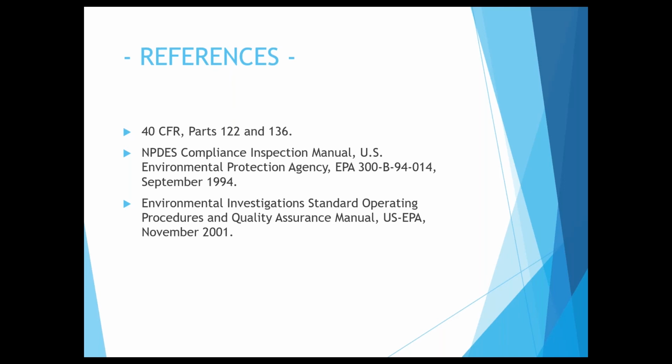All right. Let's get a few questions going. Okay, hey, Cornell, a quick question. What about two separate composite samplers set up at the same location, sampling at the same time? Would they be considered duplicates?